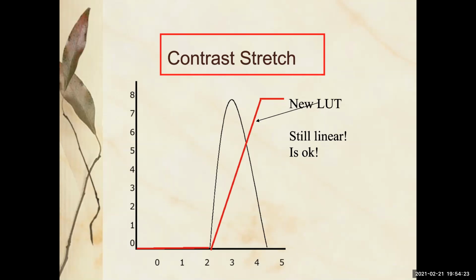So in anything where you're looking at data, there's signal and there's noise. There's what's real and what you're trying to see, and then there's just what random things pop up because there's electricity going through your system. And the good thing is that the noise fluctuates. A lot of times, there's actually 7 kinds of noise just when you're doing digital imaging. So stick with us if you want to know. We'll cover it in the advanced classes.